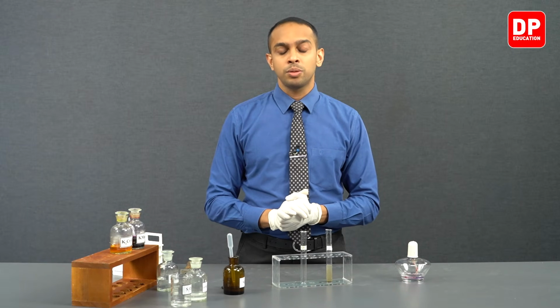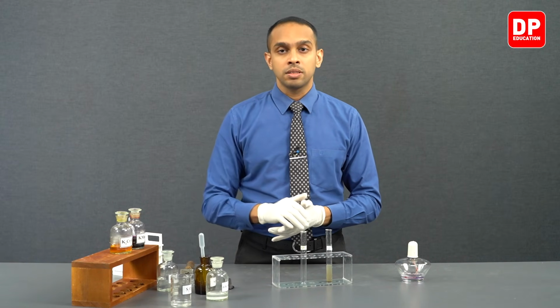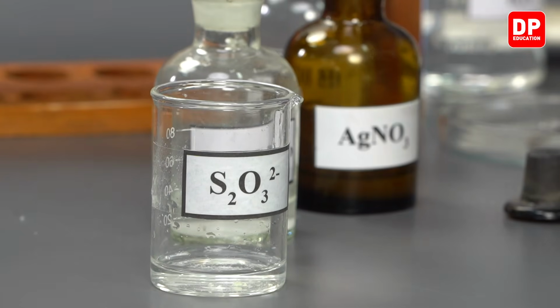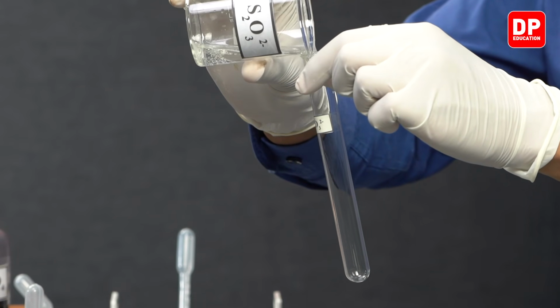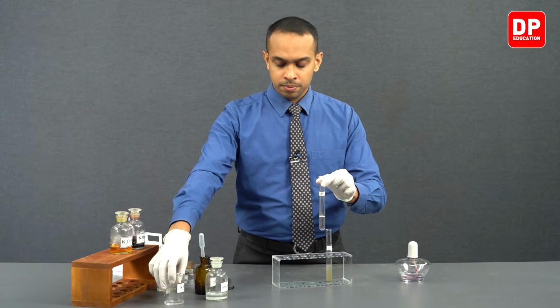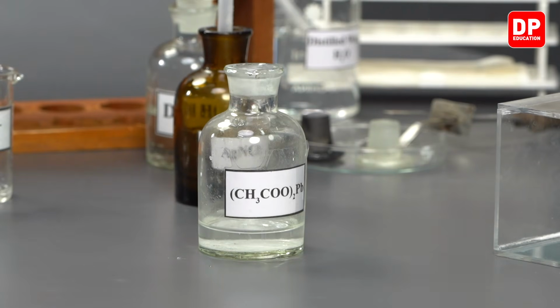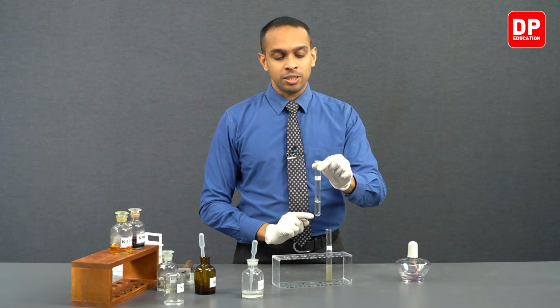Now let's do a similar experiment with lead acetate. First of all, let's take a small amount of thiosulfate ion solution into our test tube here, and then we can add a small volume of lead acetate into this test tube. So you will see, as lead acetate is added, a white color precipitate will be formed.